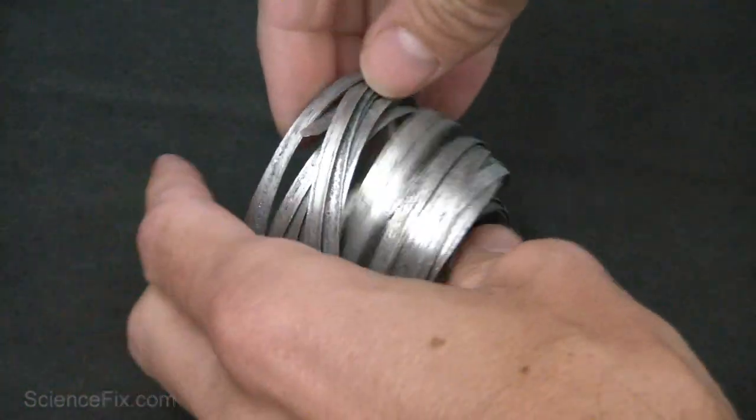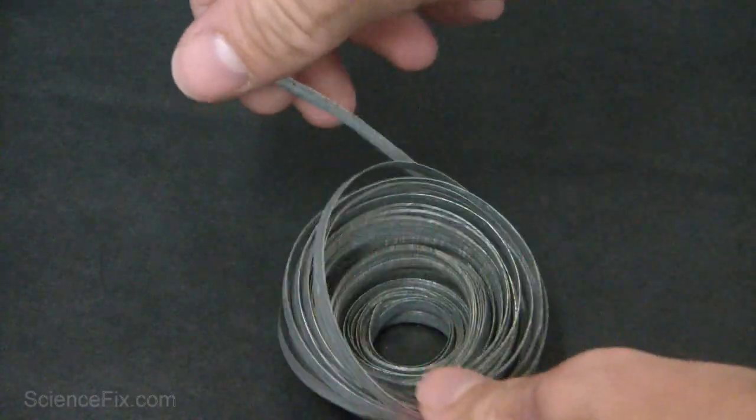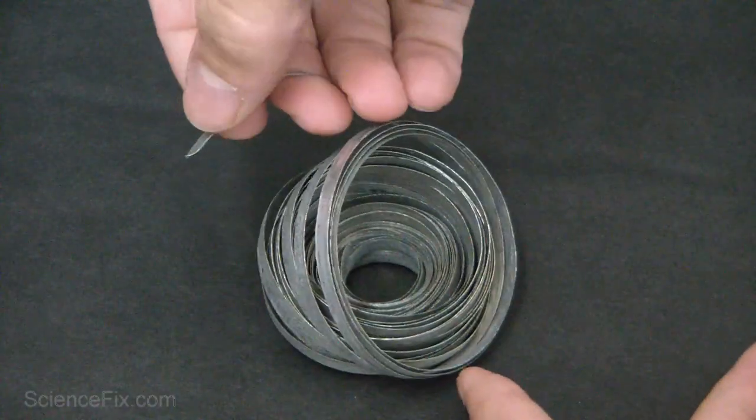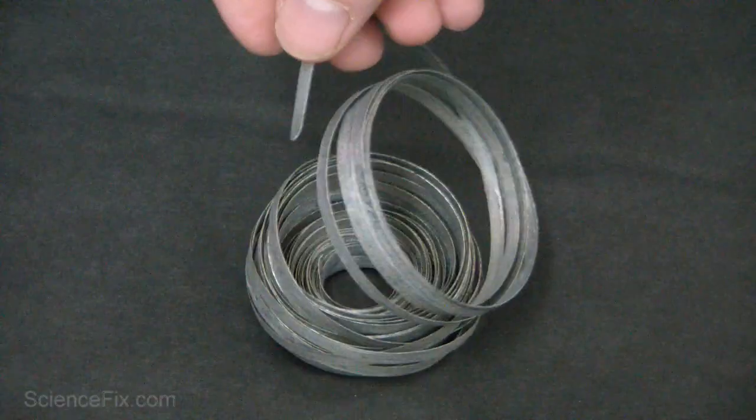Here we have a ribbon of magnesium. Magnesium is a metal. It has the properties of luster. You can see it's shiny. It's malleable. It's bendable. It can conduct heat and electricity.